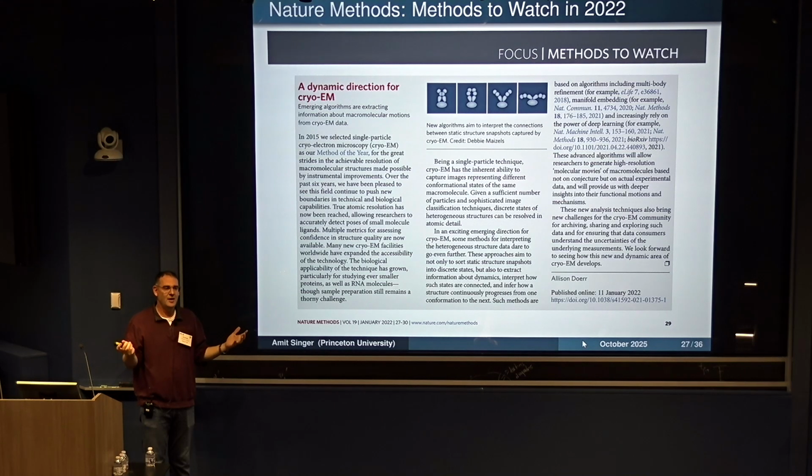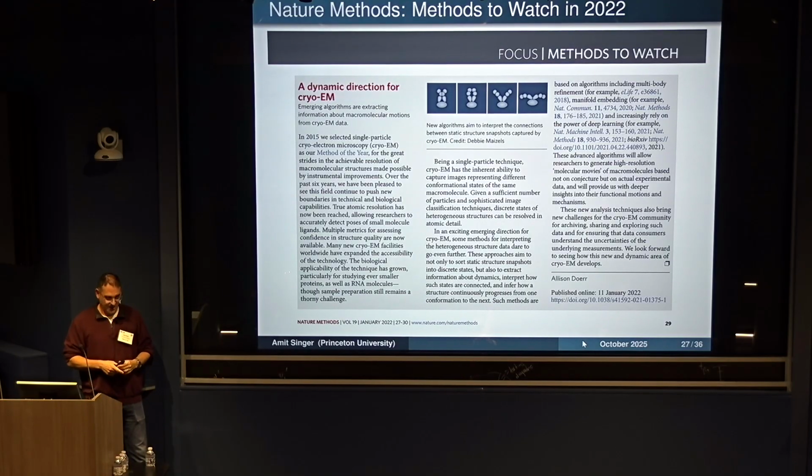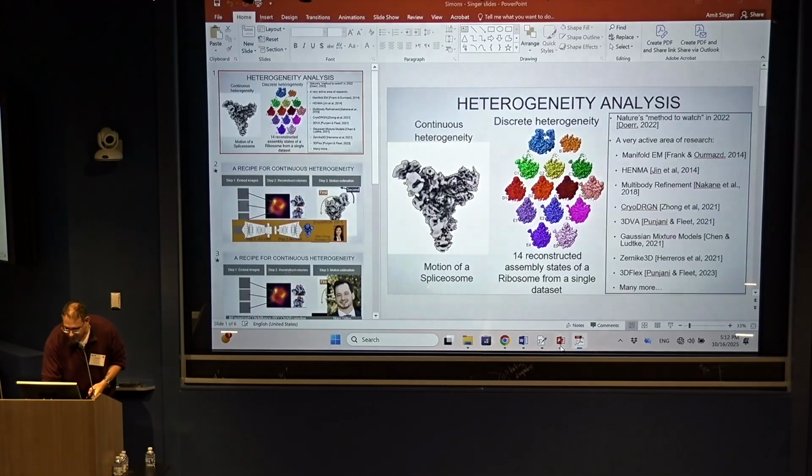How to actually now not reconstruct a single molecule, but the whole entire movie, or give you a video of what the molecule is doing. So this was one of the methods to watch in 2022 by the journal Nature Methods. And let me switch here. It's much easier to show movies in PowerPoint than in PDF. So let's switch.